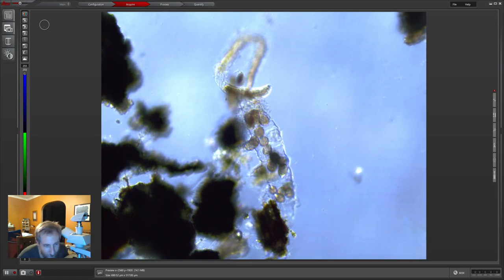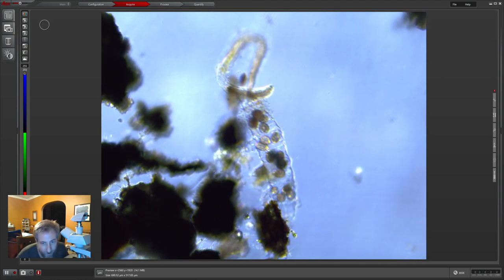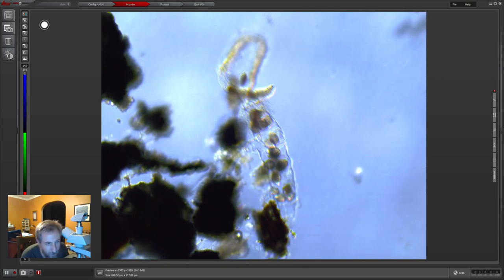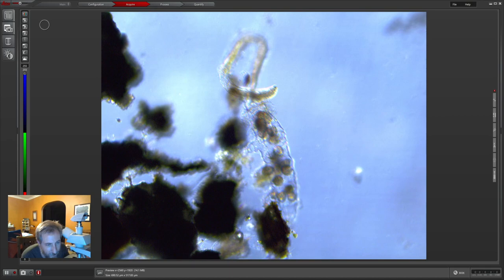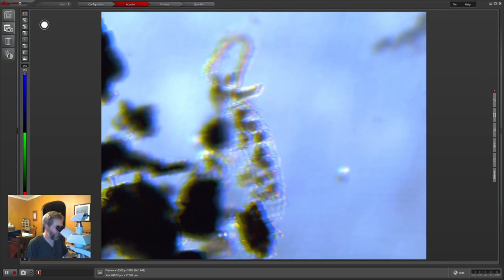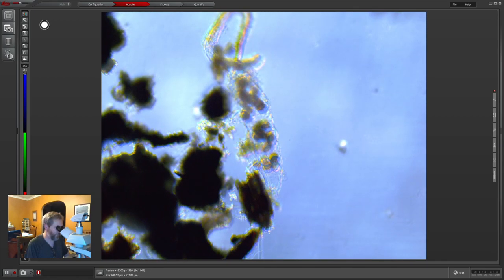What's going to happen to the water bear when we're done with the slides? One of them I've collected for the SEM, but these little guys in the egg casings — I'm hoping to keep them around and get them to hatch. The normal process for the bigger water bear is it would just dehydrate and go into its cryptobiotic state, called the tun state, where they just kind of hang out.